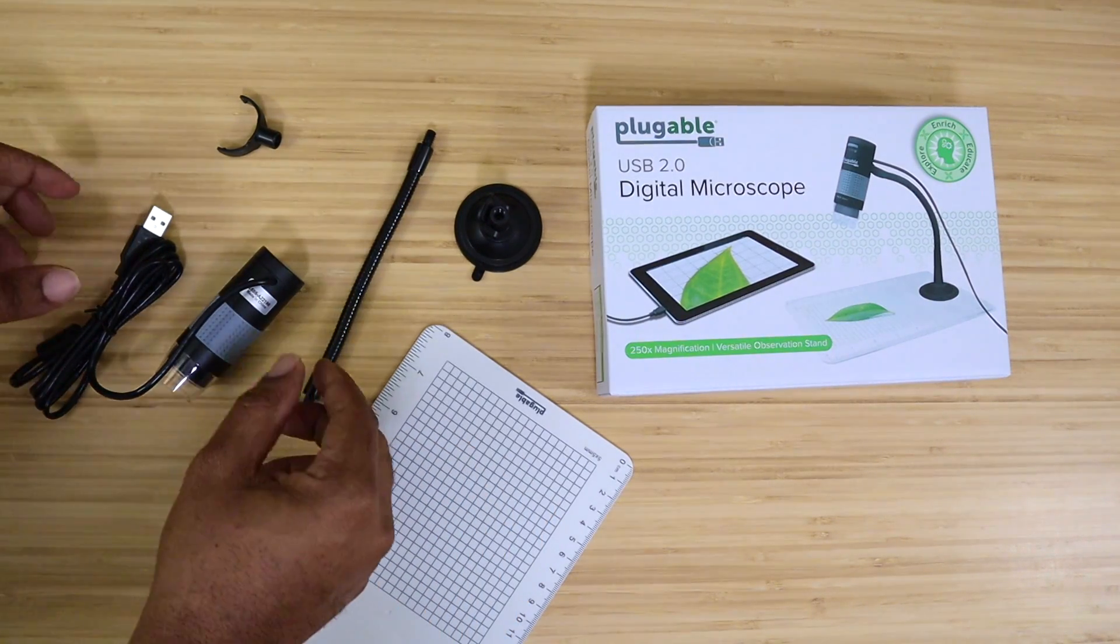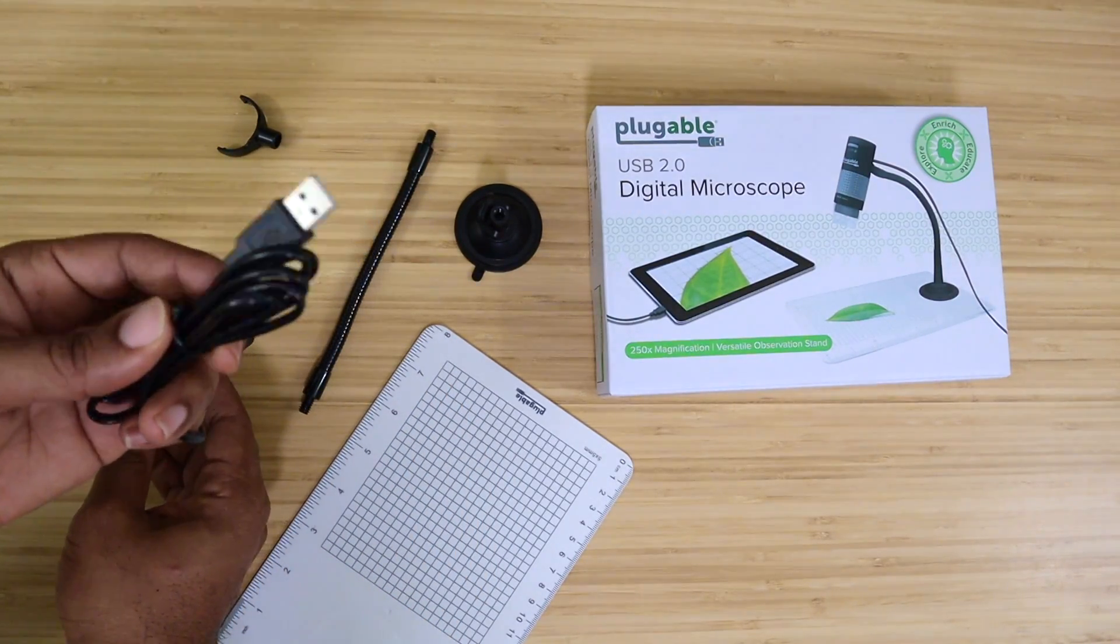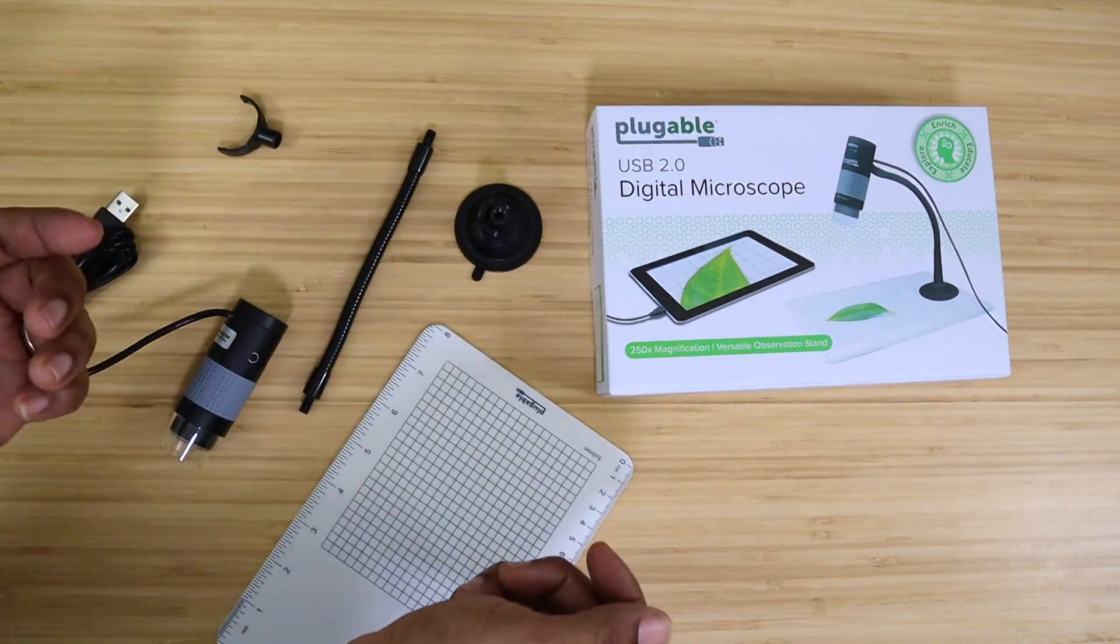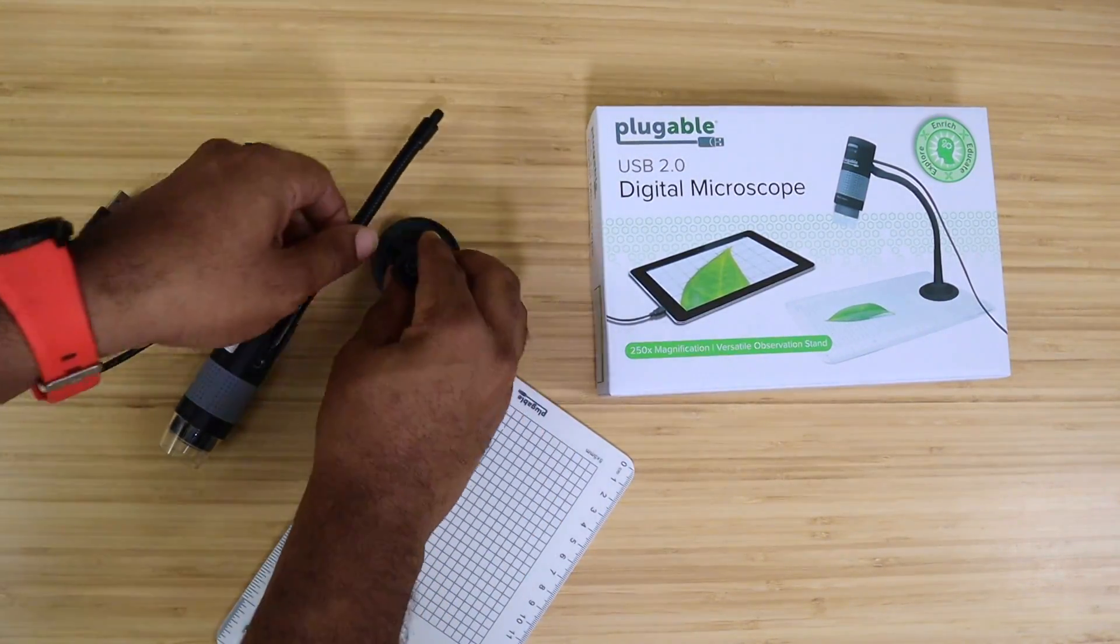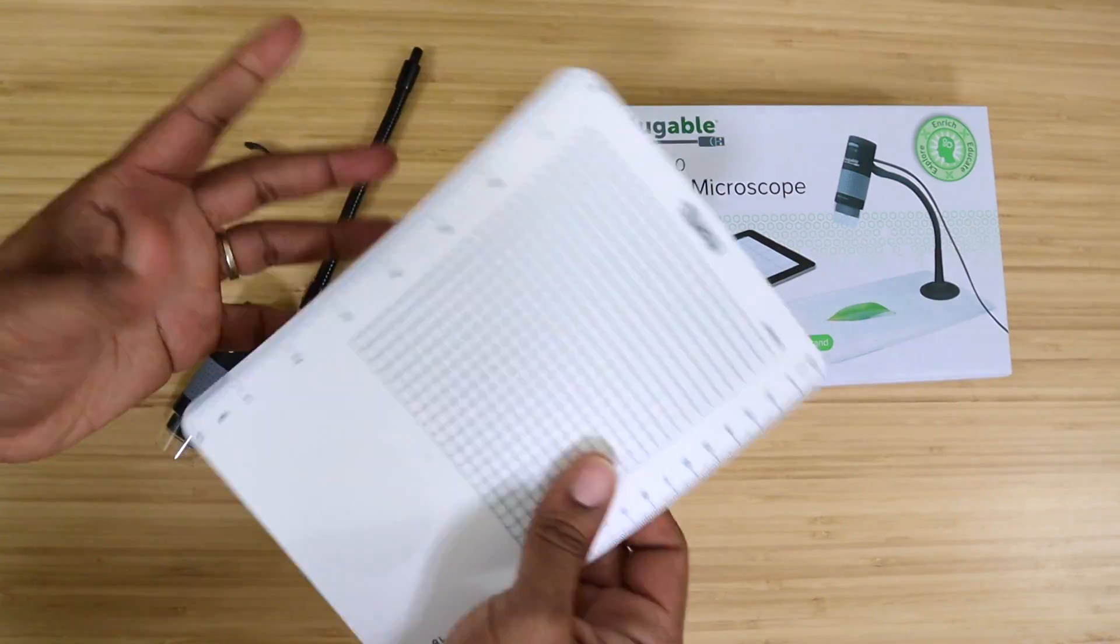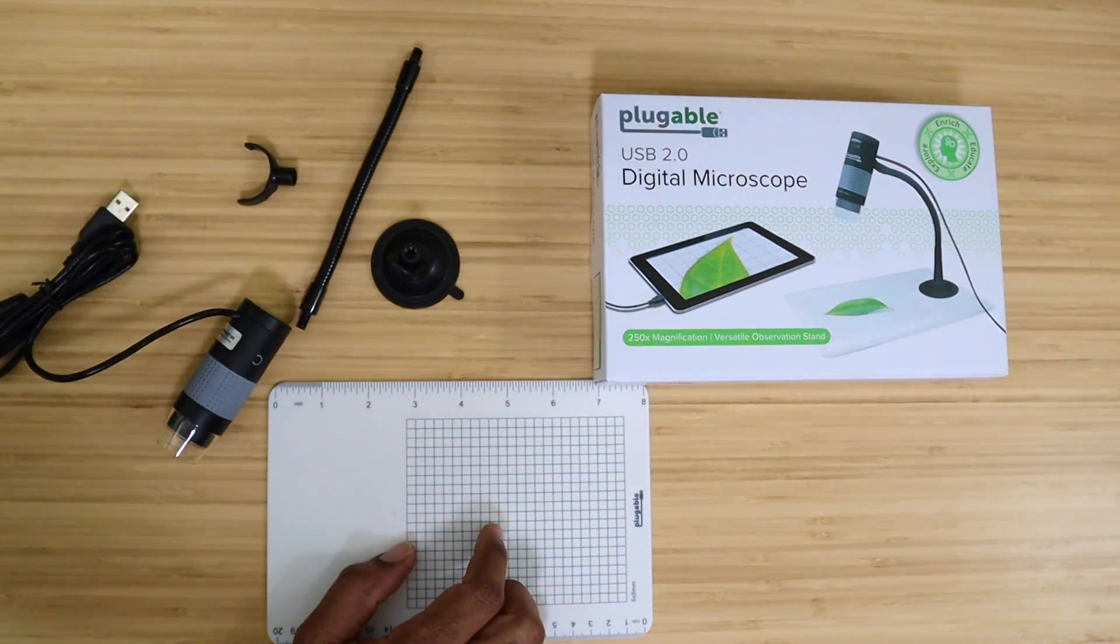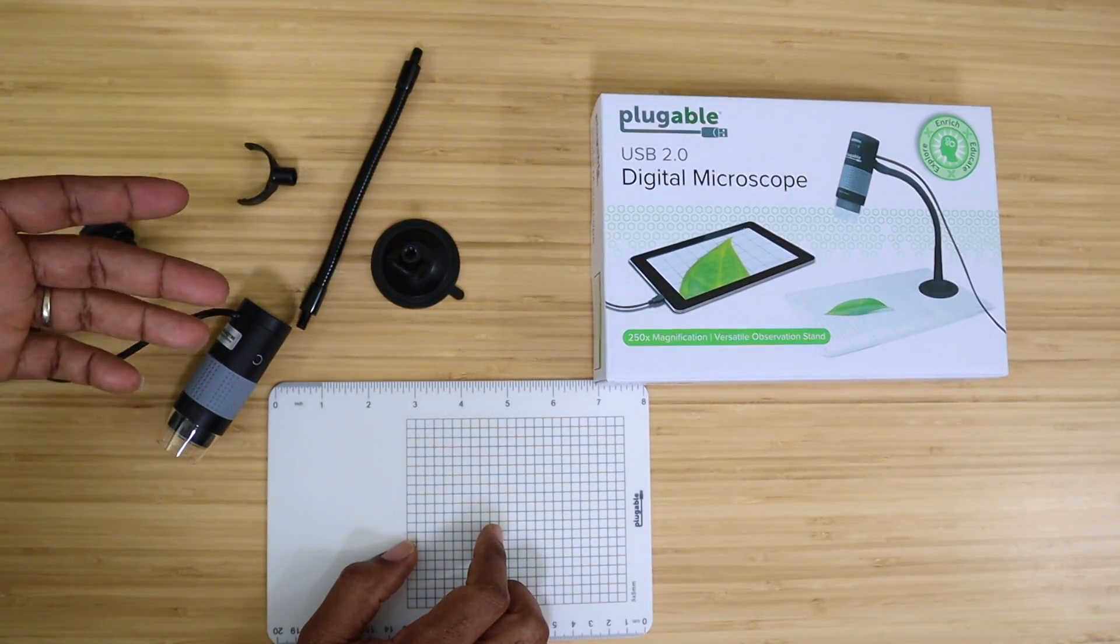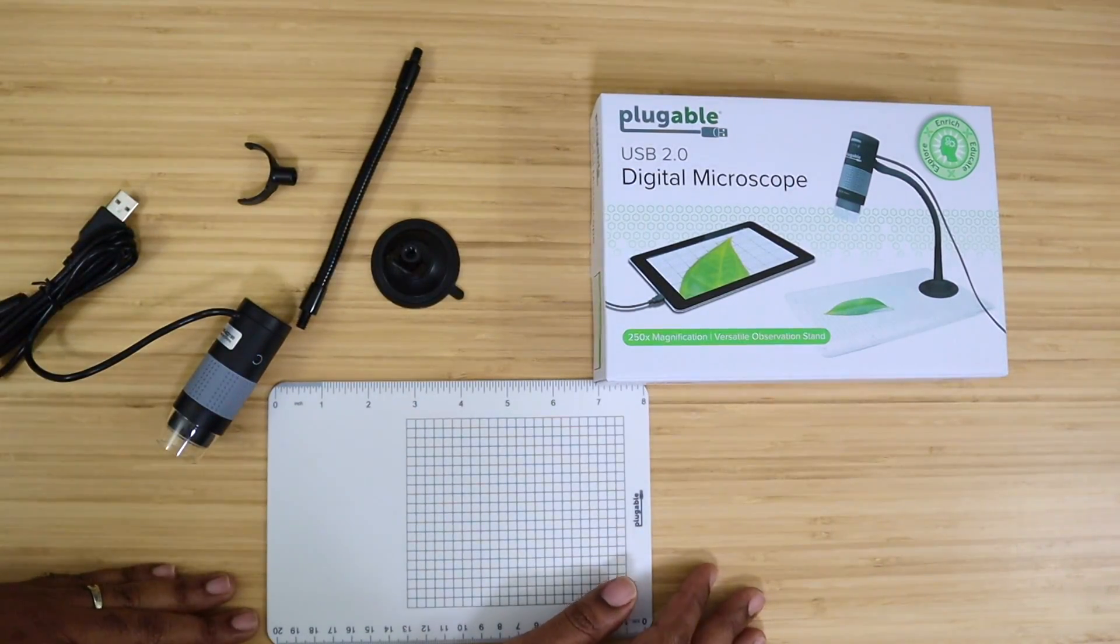So out of the box you're going to get the actual microscope itself with USB, and this is USB Type A, no USB Type C. USB 2.0. You get a holder, a stand set right here, and then a plastic mat with a hard backing. It actually has rulers on each side so you can use it as a straight edge as well. Let's go ahead and get this thing connected and see what we think about it.